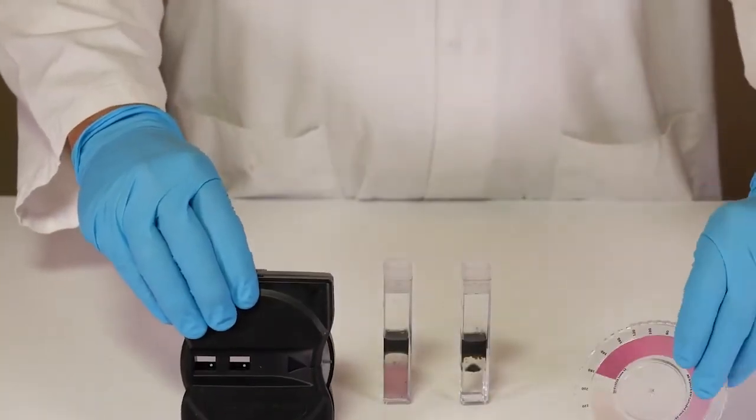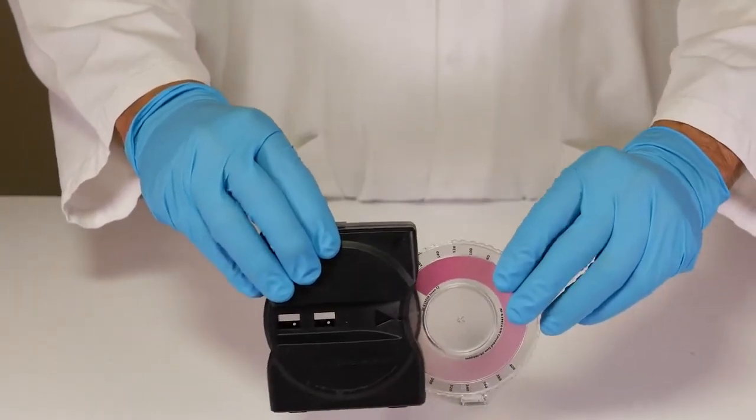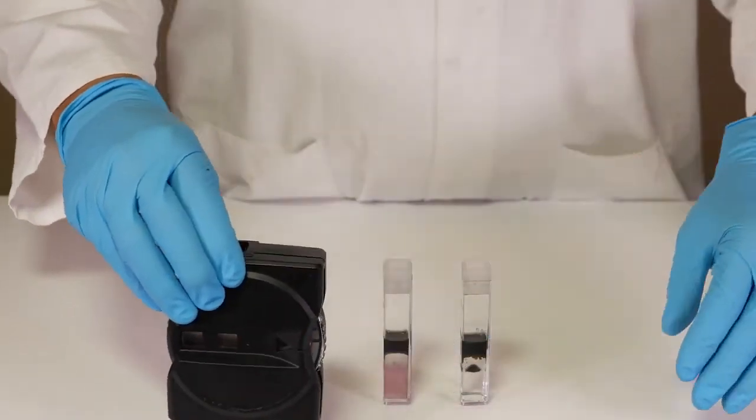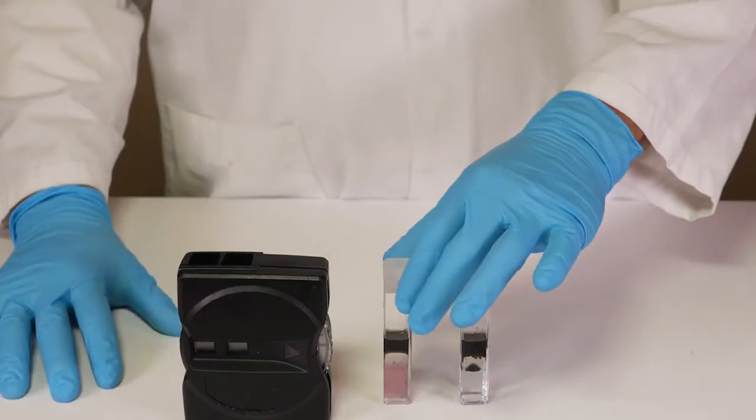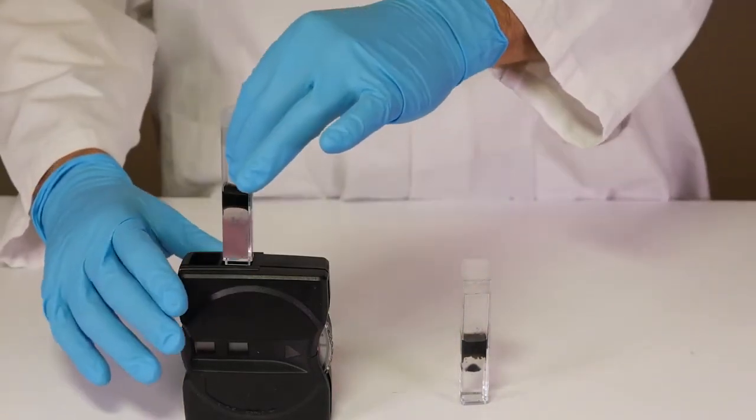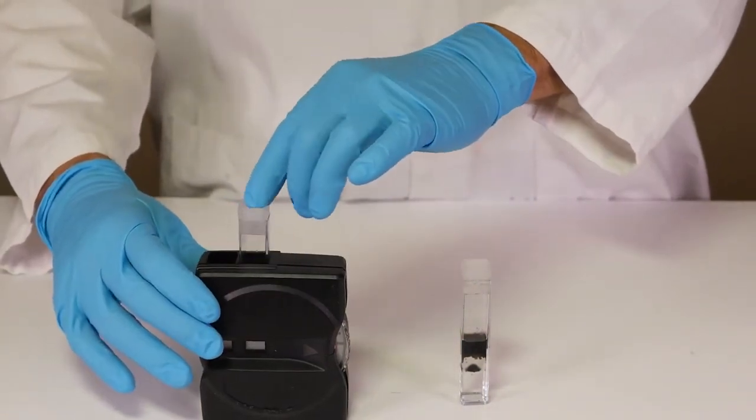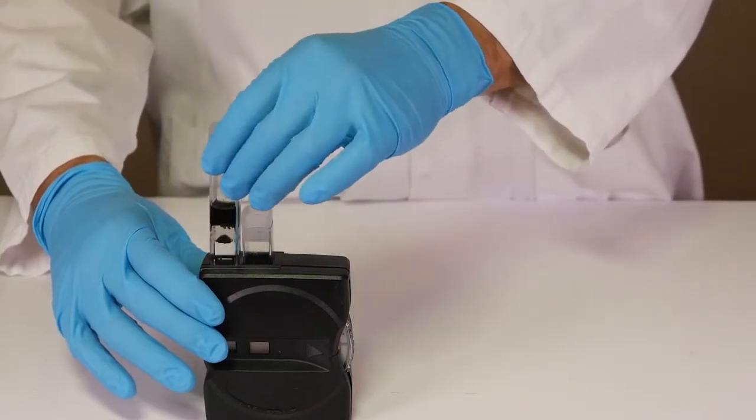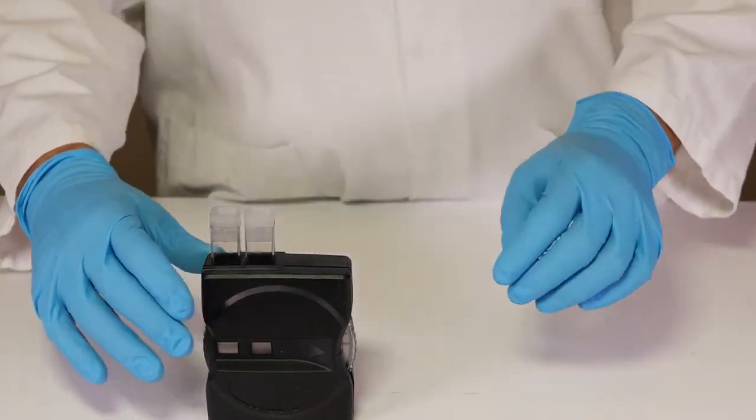Insert the colour wheel into the comparator. Place the cuvette containing reagent two into the center most slot and the cuvette with reagent three into the outermost slot.